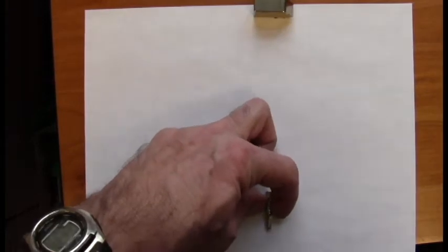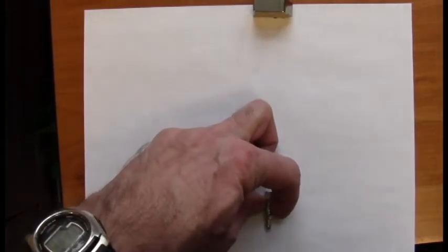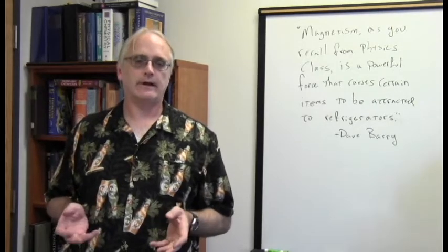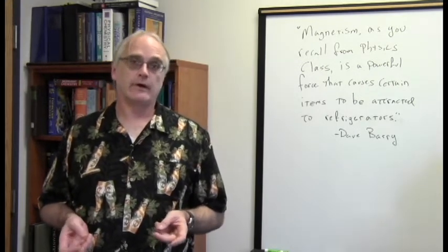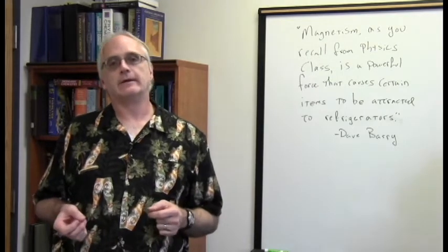Now, of course, in reality, we don't use fingers to reach in and grab magnets. We use photons. My resemblance of my fingers to a photon is, of course, purely coincidental. We use photons to reorient our nuclei, and we measure very carefully the energy of the photons that cause that process to occur.